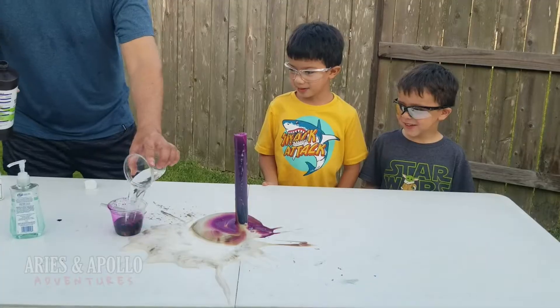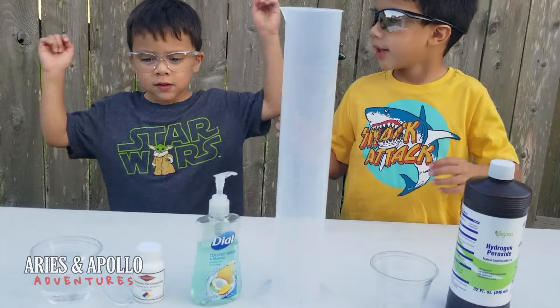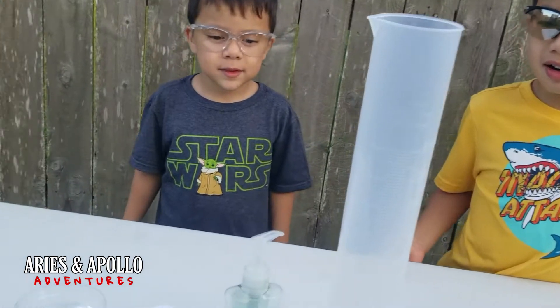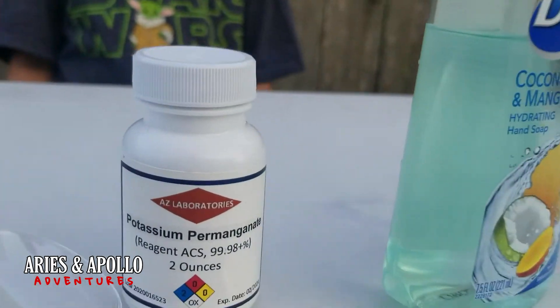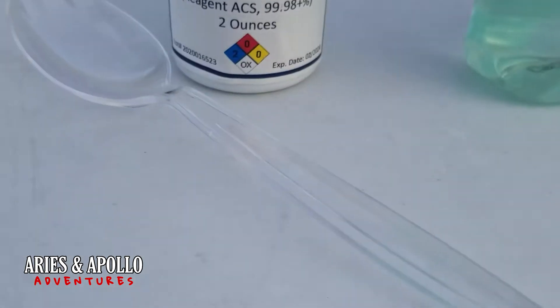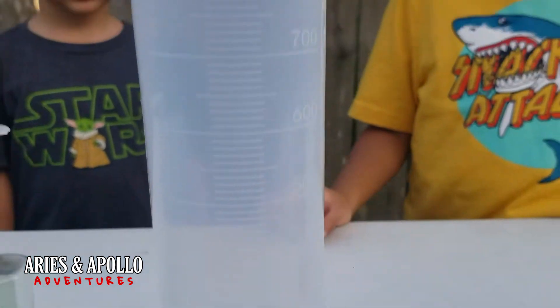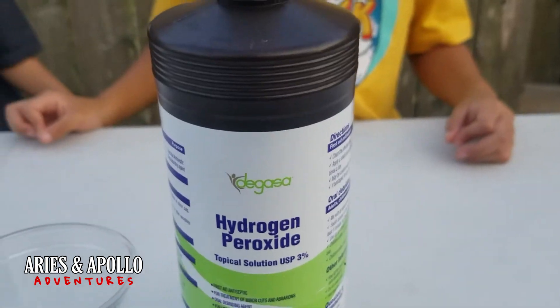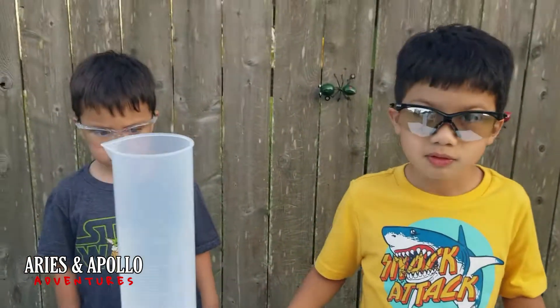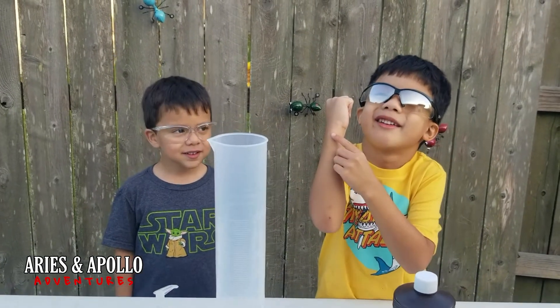What experiment are we doing today? In order to do that, you're going to need a cup of water, potassium permanganate, a spoon, dish soap, one of these cylinders, another cup, and some hydrogen peroxide. Then we're gonna mix that together like mad scientists, right?